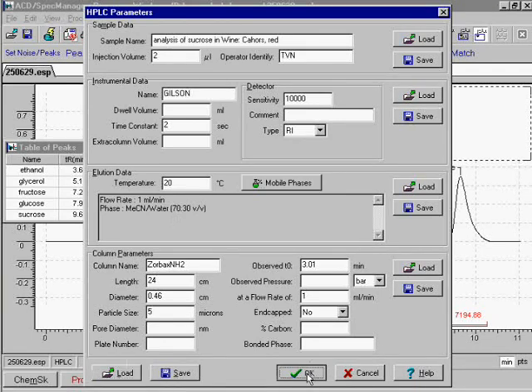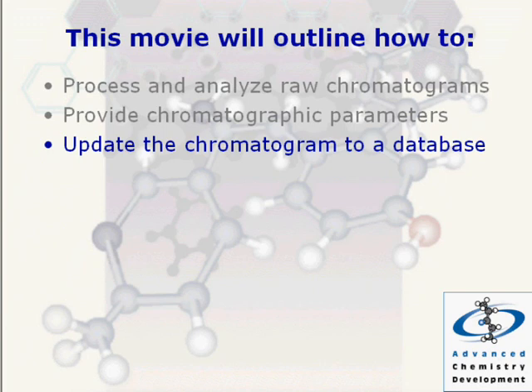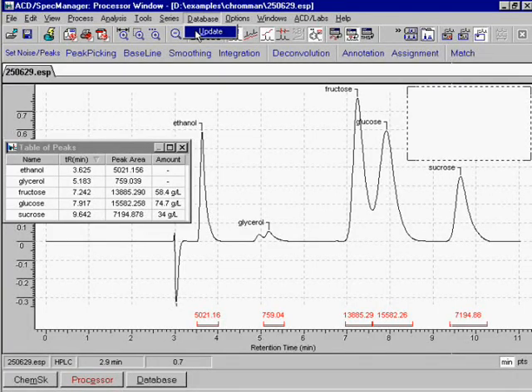Next step, save your chromatogram to a database. In ACD Chrome Manager, you can easily update your database with the new data. The resulting database can be a valuable resource for future experimental work and method development.